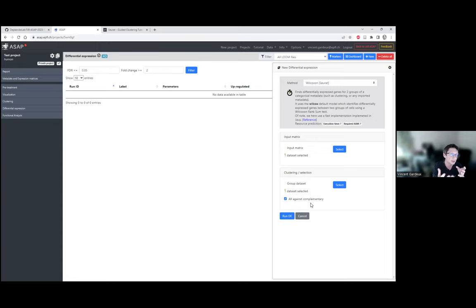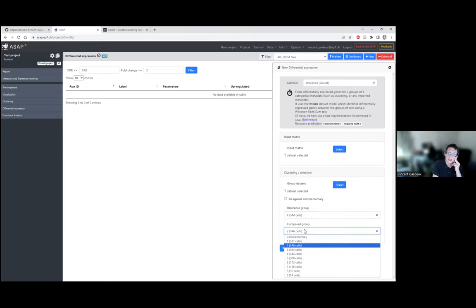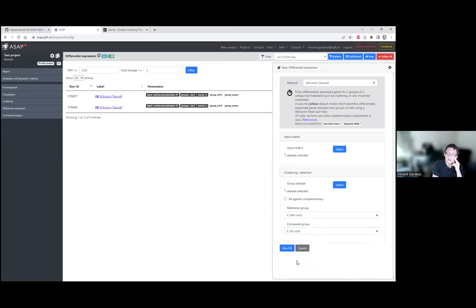So you have more options in this view than in the evidences view. So that's a good way probably to run it anyway. But you can also do something else. If you have some clusters that are very, very similar, and you don't know if they are really different cell types or if it's actually the same cell type, what you can do is pick a cluster of interest, like cluster four, and run a comparison with cluster, I don't know, eight, for example. And then you run it, and it will basically do really only these two clusters comparison.